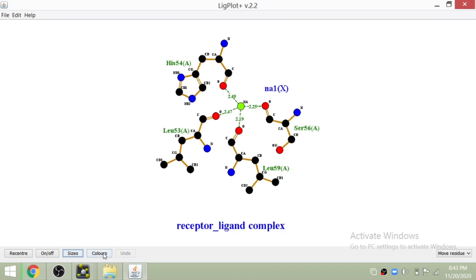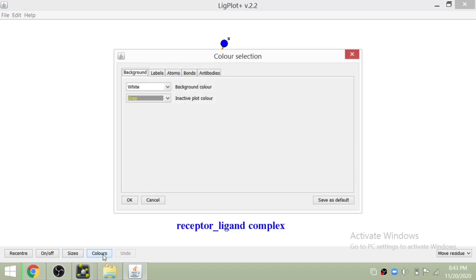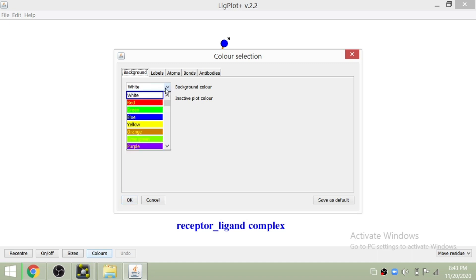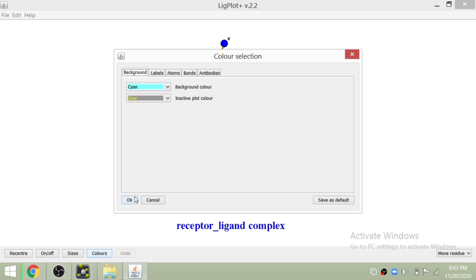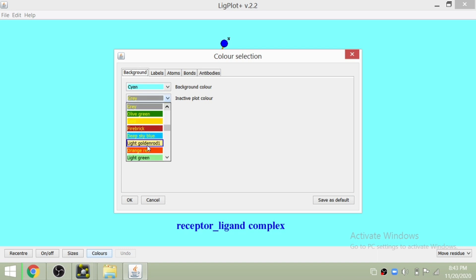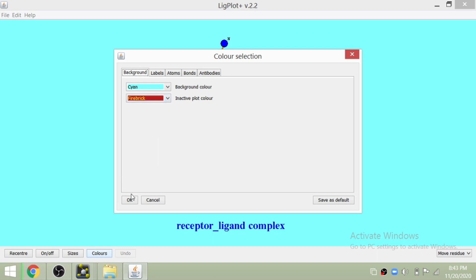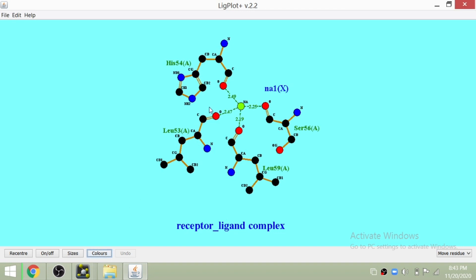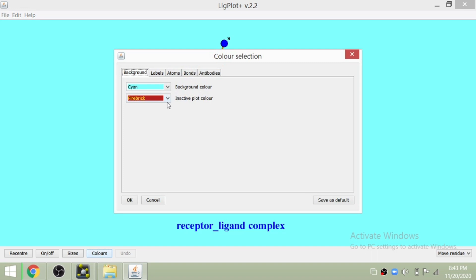There are a number of other options which you can use to view the interactions. You can also change the color of the interactions or the background — anything you want. For example here you can see the color is changed, and the colors of the different interactions are also changed.